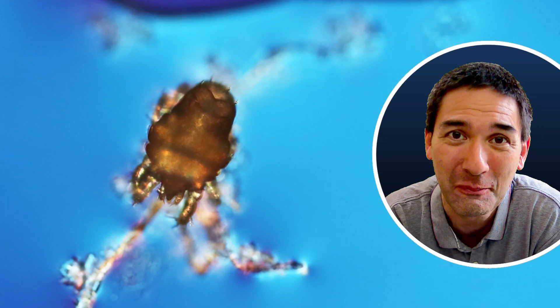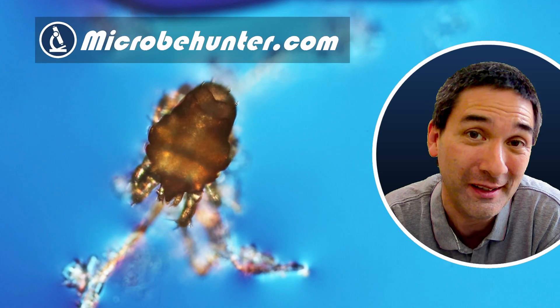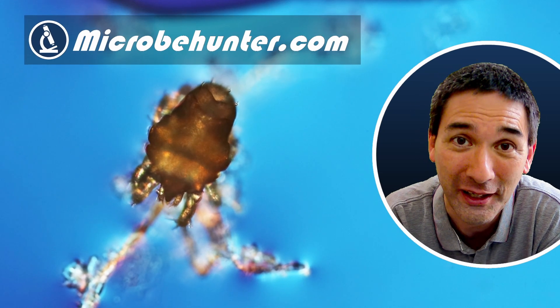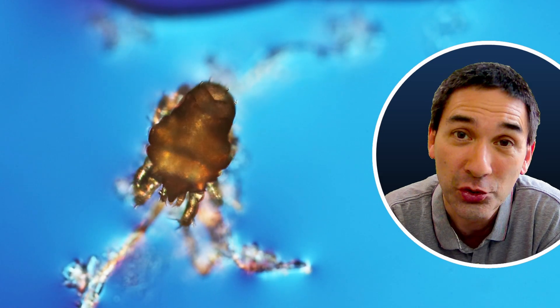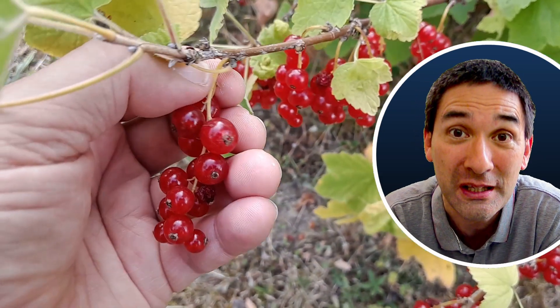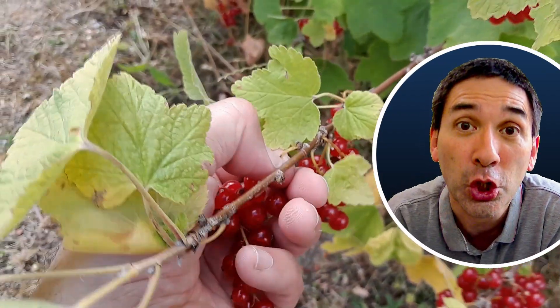Well, hello and welcome — Microbe Hunter here. Yeah, a little bit of a disgusting thought, but let me tell you the story right from the beginning. Those mites are so small that they're almost impossible to see, but they're living on those so-called red currant berries.